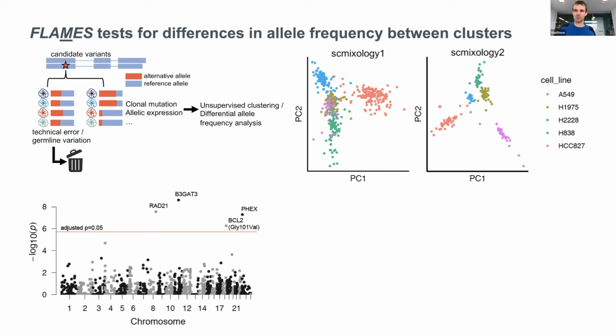If we then look at the patient sample, this is where it's more likely to be interesting, because we have cancerous cells and normal cells. We'd be very interested to find mutations that might have accumulated in those CLL cells that are not present in the normal healthy cells, and that might be a hallmark of resistance or give us some clue about the clonal structure in this particular tumor.